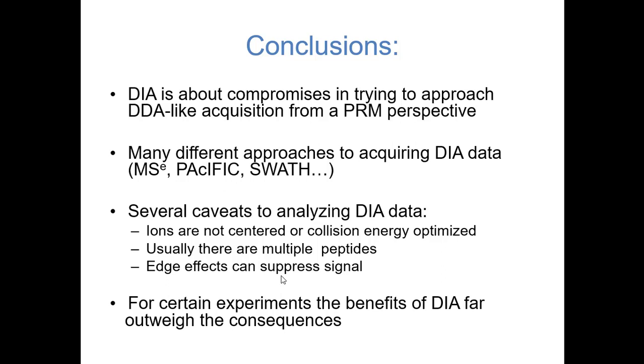So you lose basically the biggest advantage, I think, of iTRAQ, which is the idea that you can multiplex a bunch. Now you have to do a bunch of fractionation and actually do the acquisition. But that said, I think that's the only thing that will achieve the same level of precision as you would get with something like DIA.